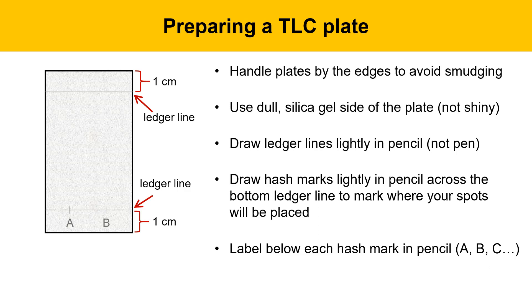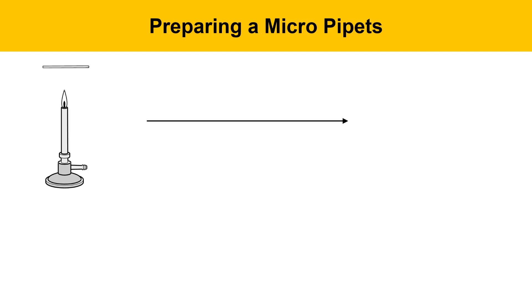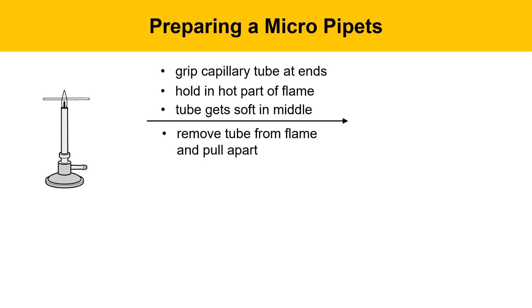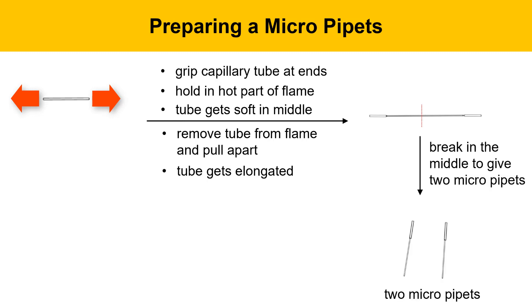Next, we'll describe preparing micropipettes to put spots on the plate. Start with a Bunsen burner flame, get a piece of capillary tubing, grip it on its ends, and hold it in the hot part of the flame. The tube will get orange hot and soft in the middle, like a wet spaghetti noodle. Remove the tube from the flame and immediately pull it apart — it will get elongated in the middle. Breaking this elongated tube in the middle gives us two micropipettes, which can be used to spot TLC plates.